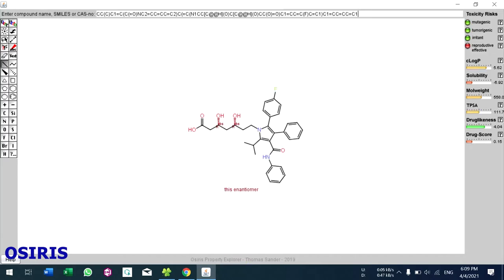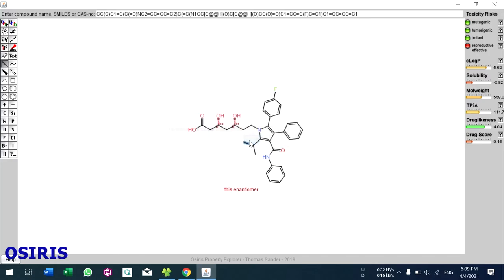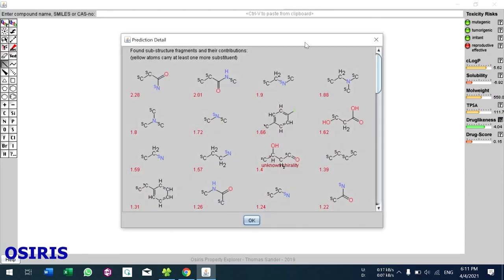After pasting the SMILES format and clicking enter, the compound appears and results show in the right-hand side window: toxicity risk, clogP, solubility, molecular weight, total polar surface area, drug likeness, and drug score. If you don't know any of these properties, click the question mark to get an explanation — for example, this is the drug likeness.